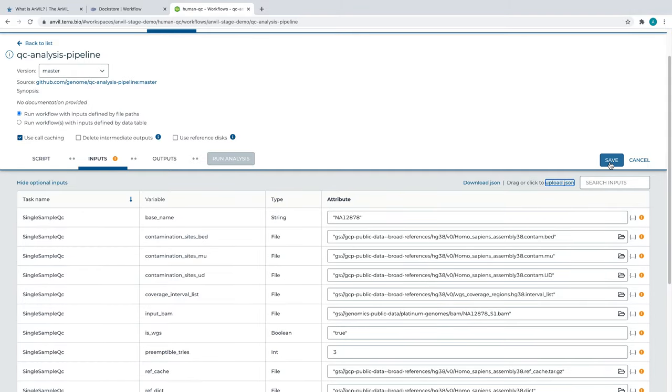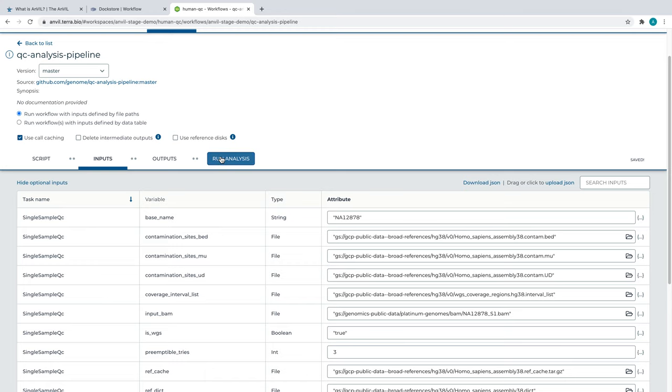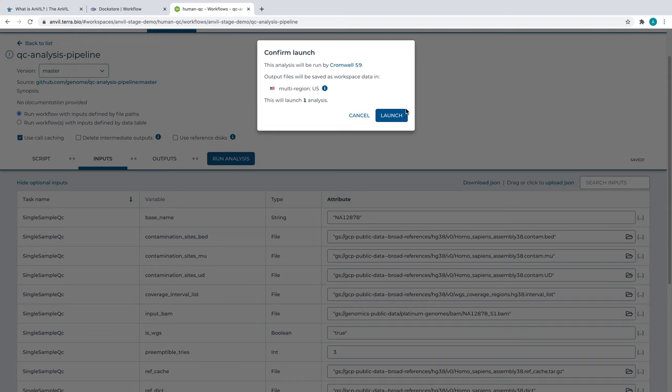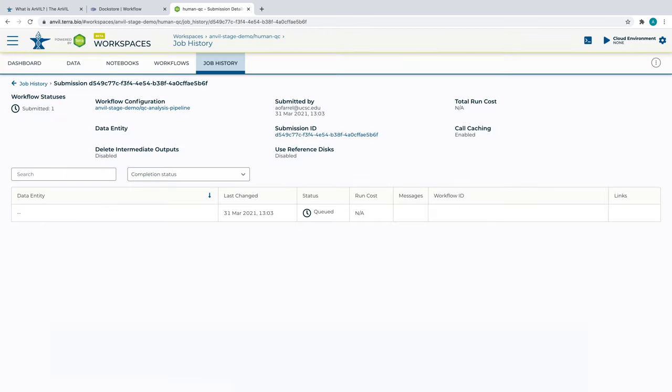The fields required by the workflow have been filled in automatically with the fields in the JSON file. All that is left to do is save and run the workflow. We're taken to a new page showing the progress of our workflow. This page will be updated once Google informs Terra of an update to the workflow progress.